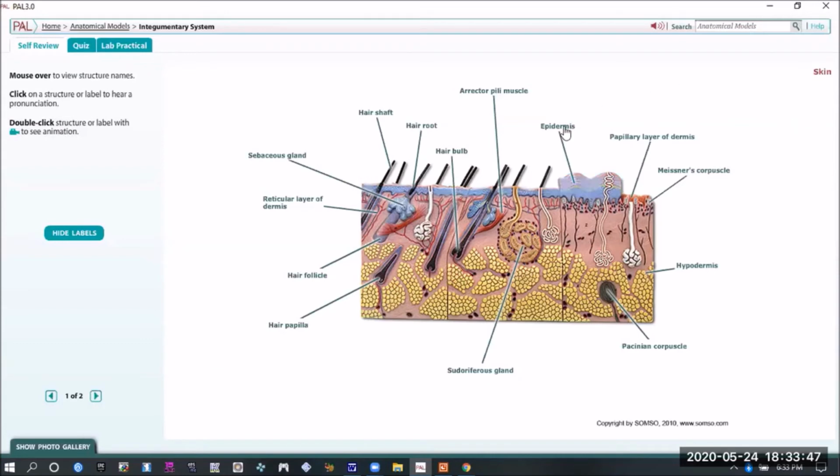Surface, the epidermis. We would zoom in closer to see the individual strata. So now deep to that, we have the dermis. And it even goes far enough to divide, there we go, the papillary layer, superficial, and then the deeper reticular layer of the dermis. That's the two major layers for the skin. And now deep to that, the underlying cushion of hypodermis.